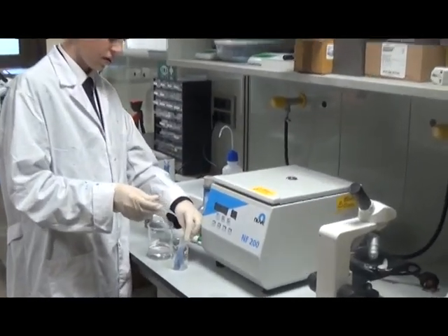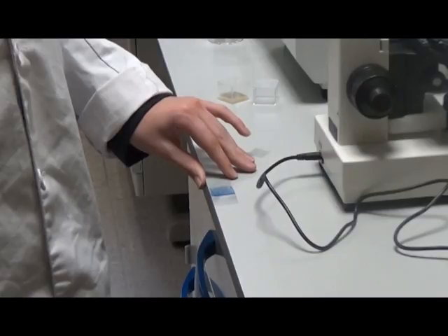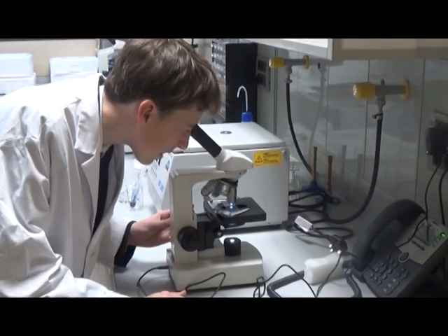Now we add fresh buffer with no dye to the pellet. This allows us to prepare a slide. A look under the microscope — liposomes!